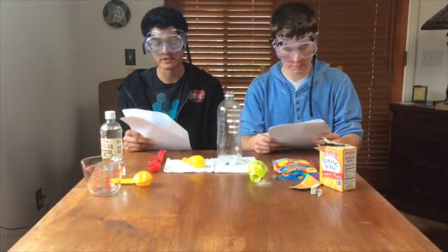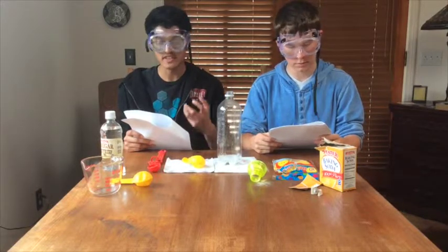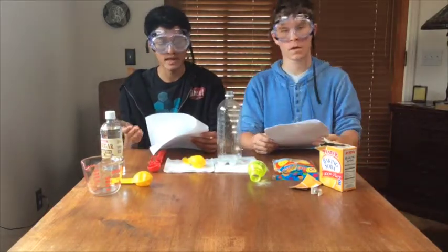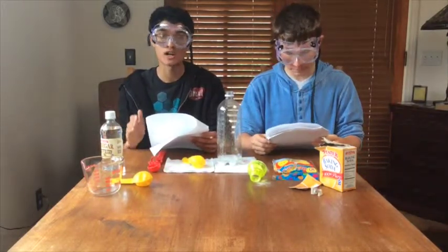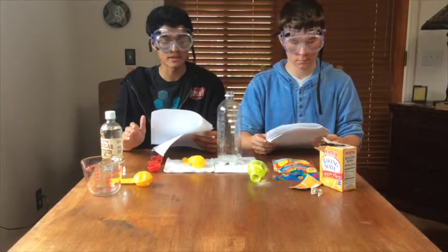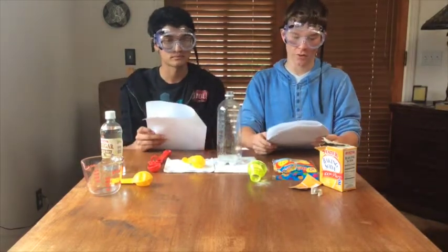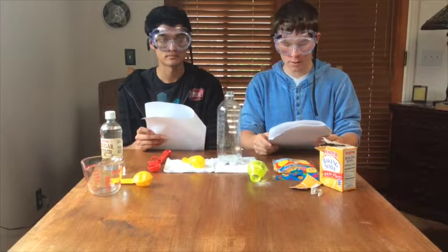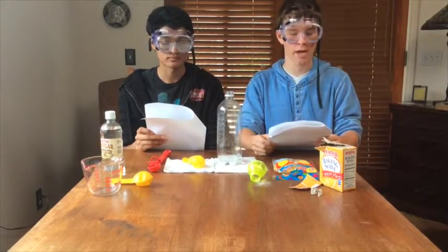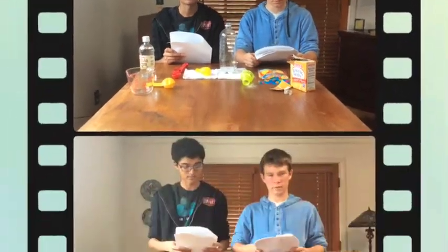Next, we can drain the remaining vinegar and baking soda in solution with the water in the bottle. Since this isn't a toxic mixture, it can go down the regular drain. However, if we were dealing with substances that are known to cause toxic reactions, or are toxic themselves, we would need to place them in a specified container provided by the teacher. When anything goes down the drain, it eventually ends up back in our environment. It is important that we keep our environment in mind when we are cleaning up after our chemical reactions. Otherwise, someday we might not have an environment to care for.